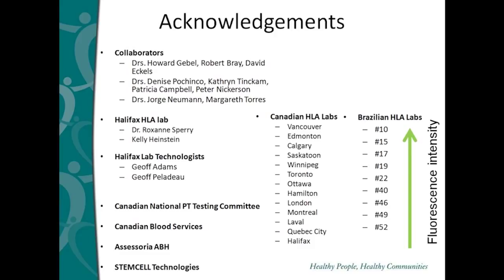On live donors, we can run, again, multiple sera. We could run the standard or allo crossmatch and auto crossmatch at the same time. Sometimes, if we have 2 to 3 crossmatches, you could run them simultaneously. We have a policy that we run them on different plates, but you could spin up to 4 plates at the same time. Once your reactions are set up, you can run multiple plates, so that really saves a lot of time and makes cross-matching possible.